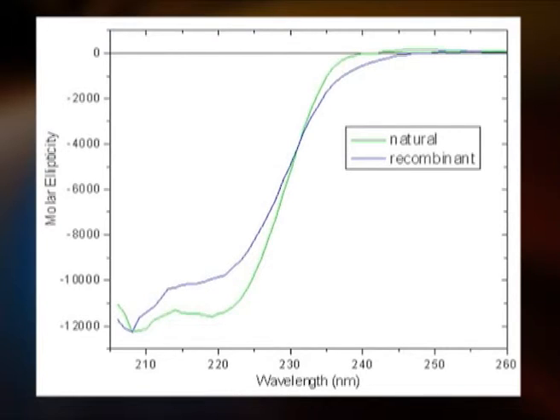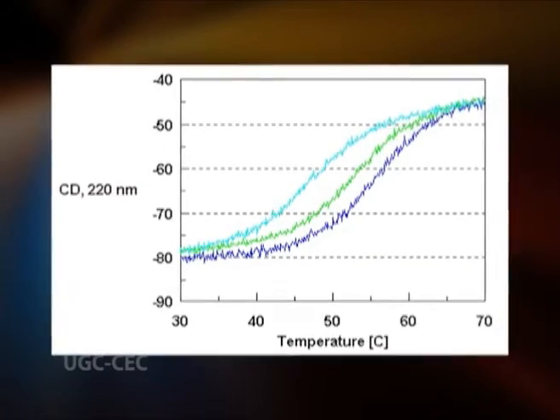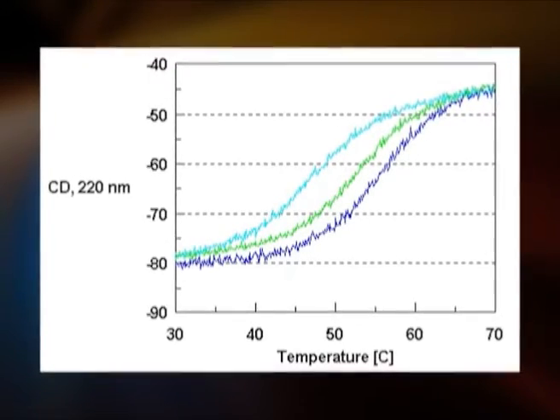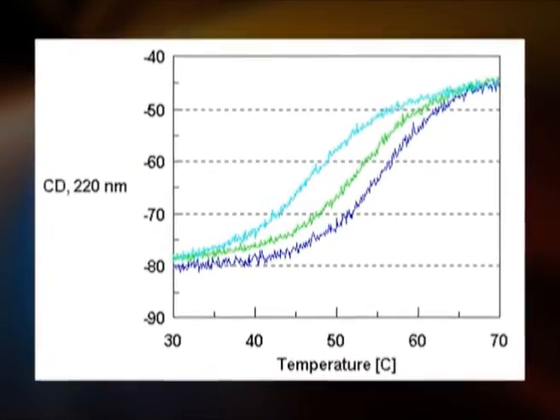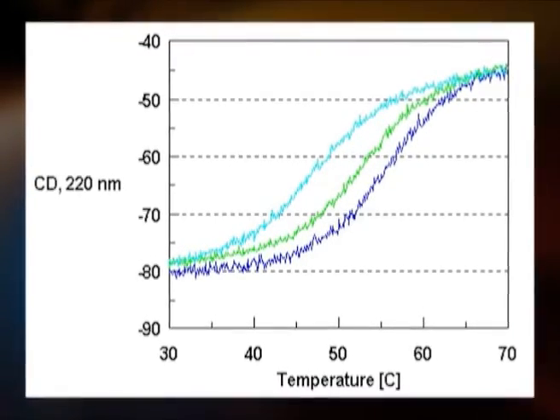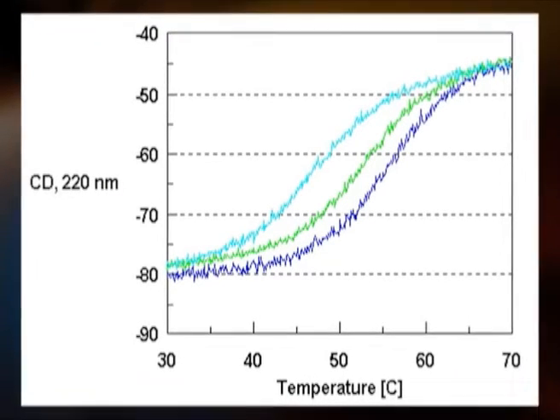It is also used for studying the conformational stability of protein under stress. CD is excellent for finding solvent conditions that increase the melting temperature and the reversibility of thermal unfolding conditions which generally enhance shelf life.